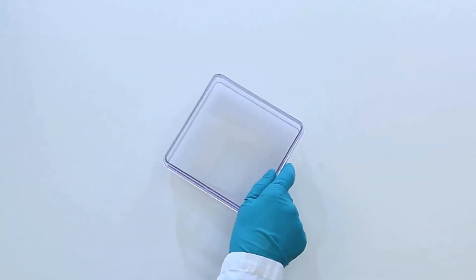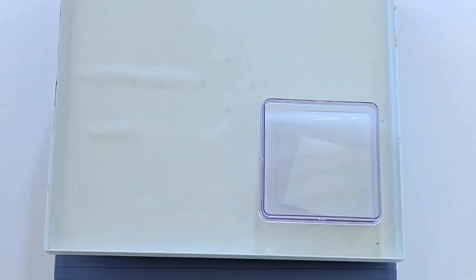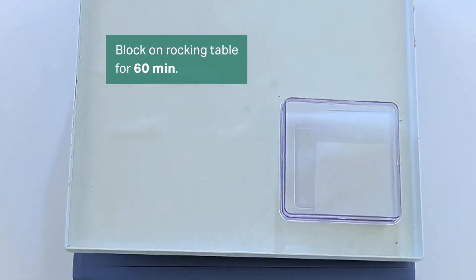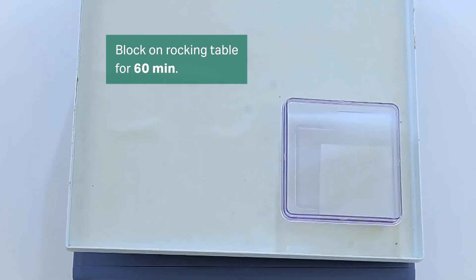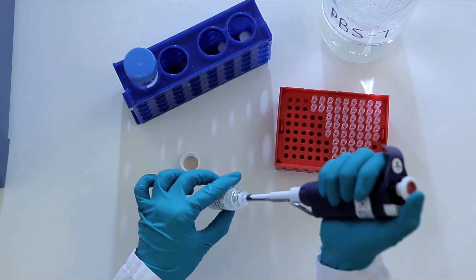Next, block the free sites on the membrane using ECL Prime Blocking Reagent, which is compatible with your other reagents. Add the blocking agent and place on a rocking table. Blocking normally takes 1 hour at room temperature. Use this time to prepare the primary and secondary antibodies.